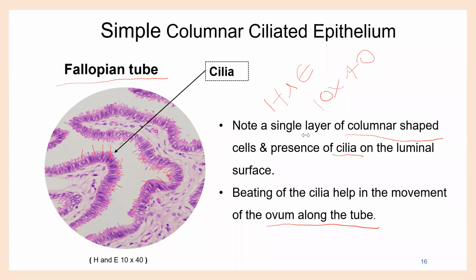Stereocilia and cilia. Yeah, okay. So again, cilia, as I told you, are of the same sort of length, and they're shorter, and the whole of the luminal surface is full of cilia. With stereocilia, the gap between each of the cilia is a little bit more, right? And they're longer. Okay.